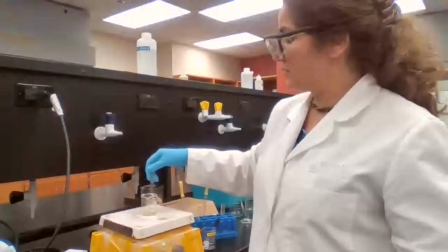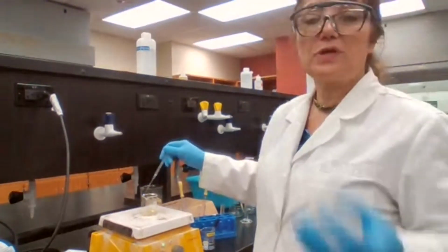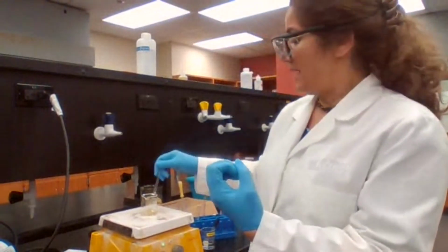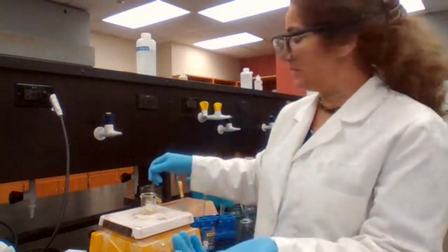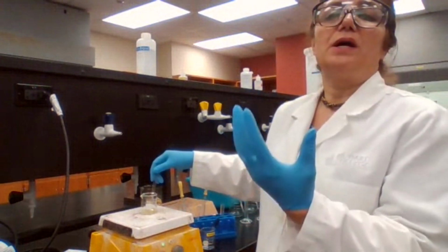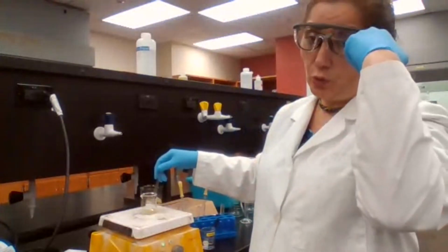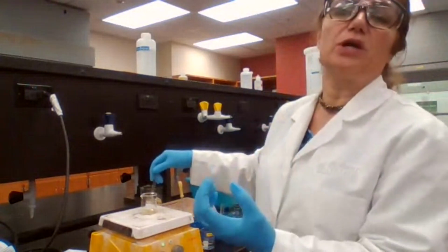You cannot do sudden cooling for recrystallization, because it would trap the impurities and it could trap the solvent. If it traps impurities, you would get impure product. If the sample traps the solvent, you would get oily product. So it would oil out instead of giving you a solid compound.